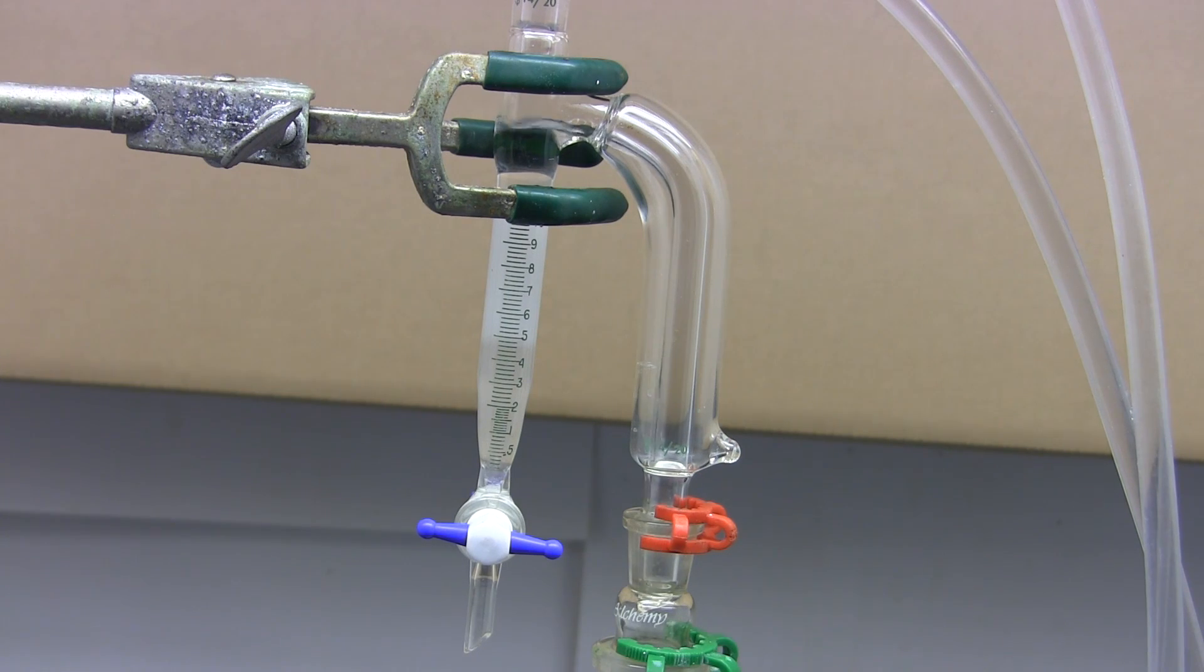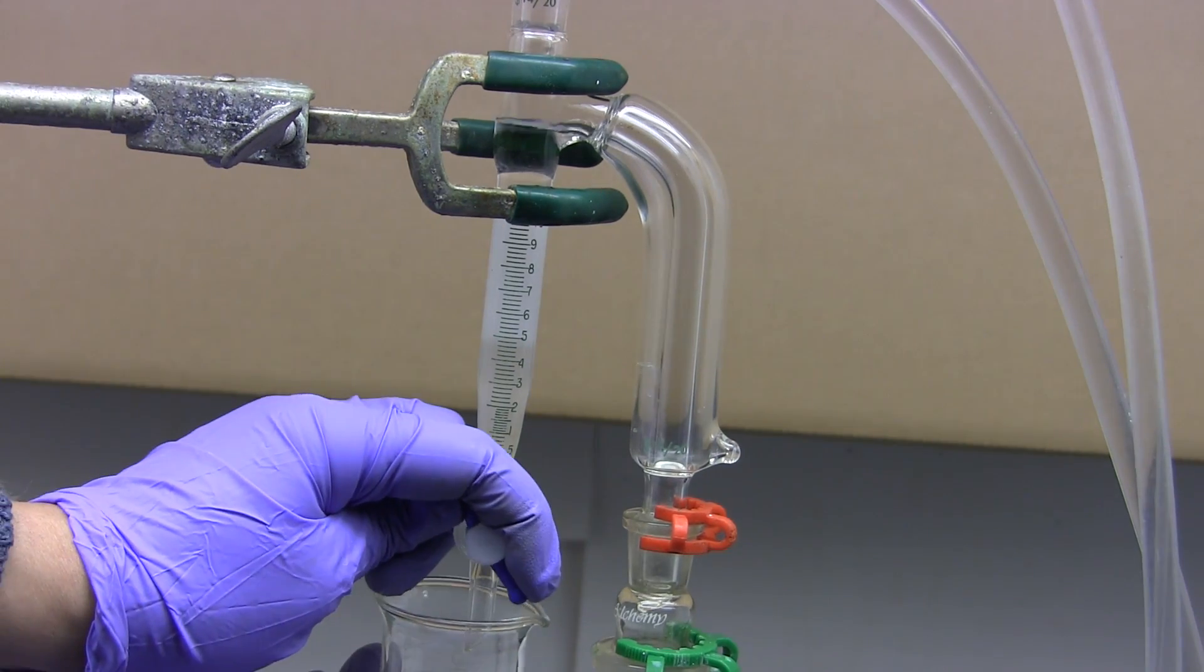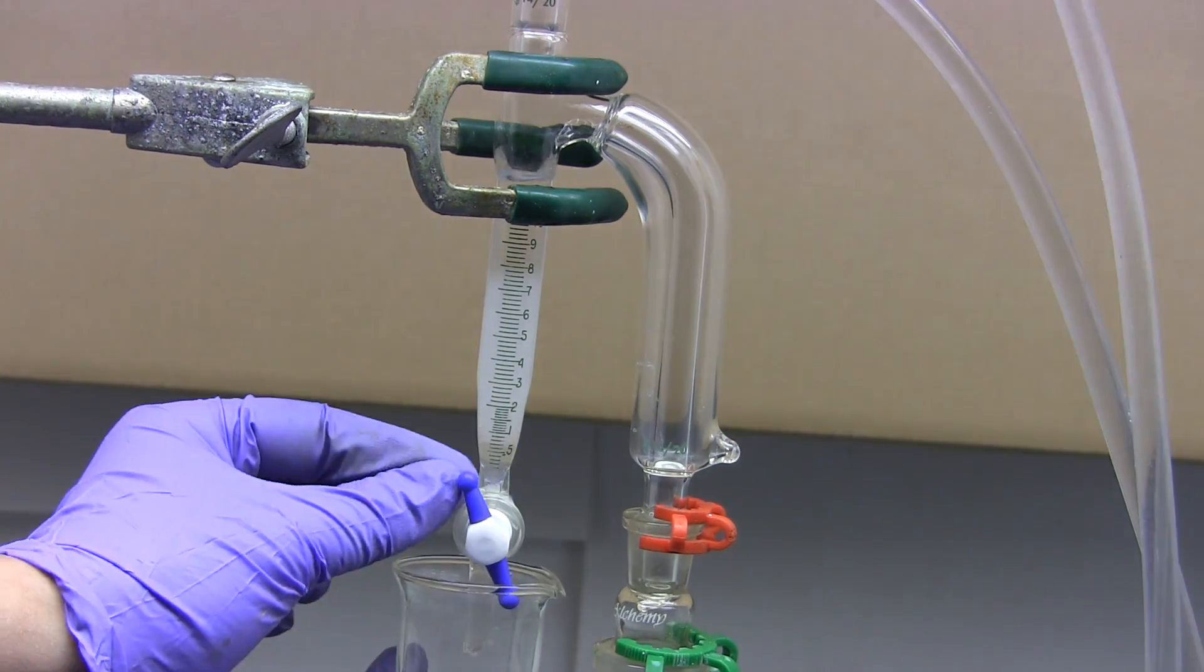If you're doing analytical work like Dean and Stark were, then you can just read off the amount collected on the graduations. Alternatively you can remove the water from the trap by using it like a separatory funnel. And there we go.